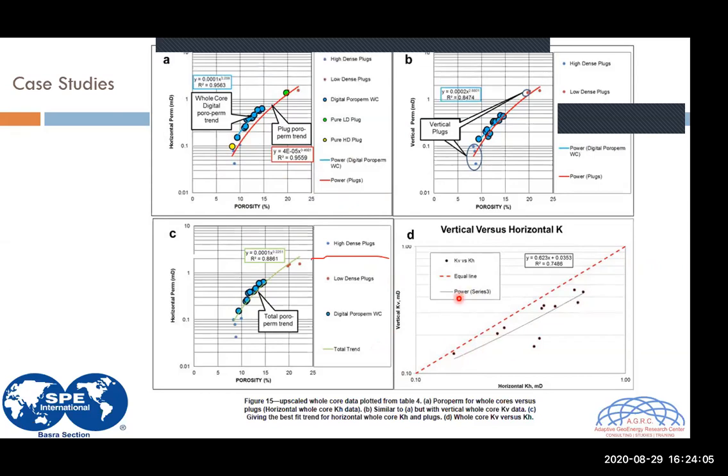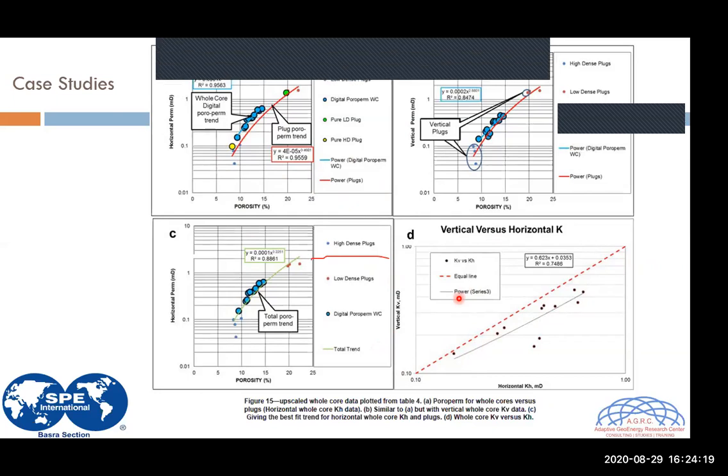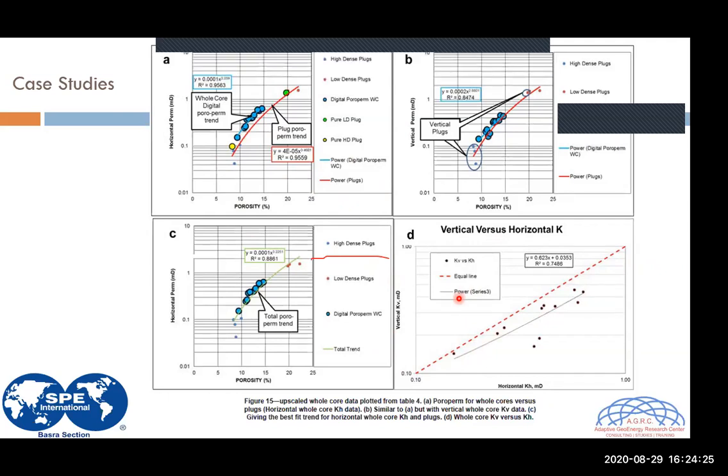So it's all parts of the analysis. We could simulate in several smaller samples using this information to populate the previous low resolution sample. And then once you have this information, you can plot the results. You try to correlate the real plugs and the information that you have from the whole core, for example.